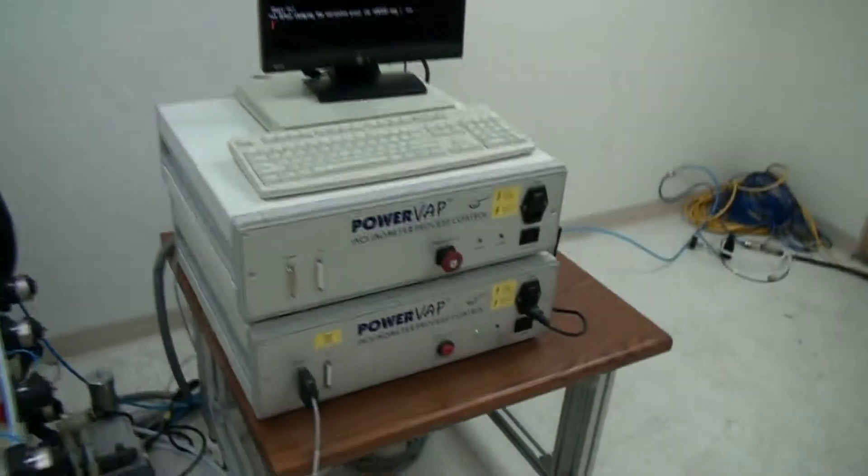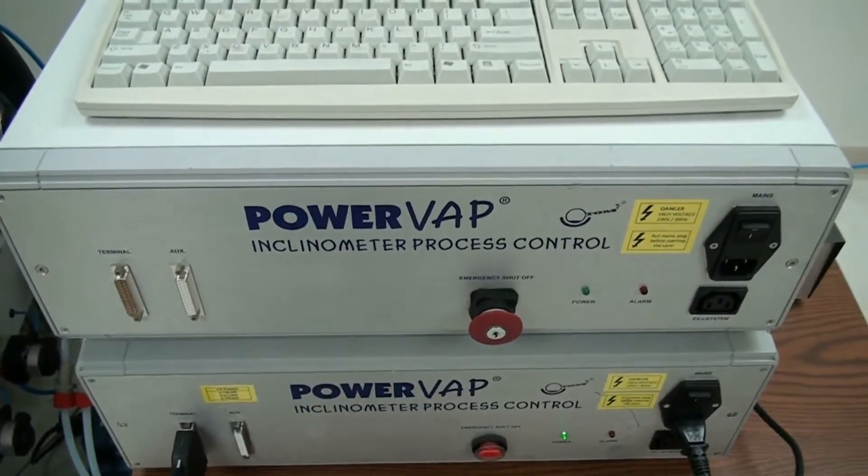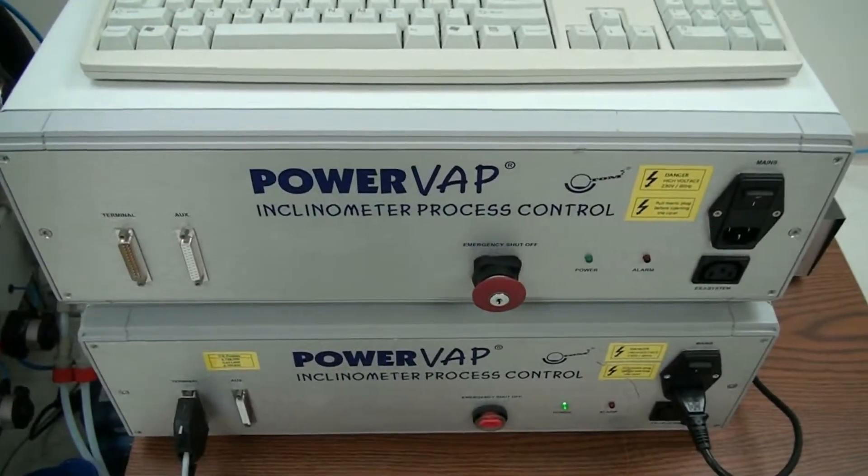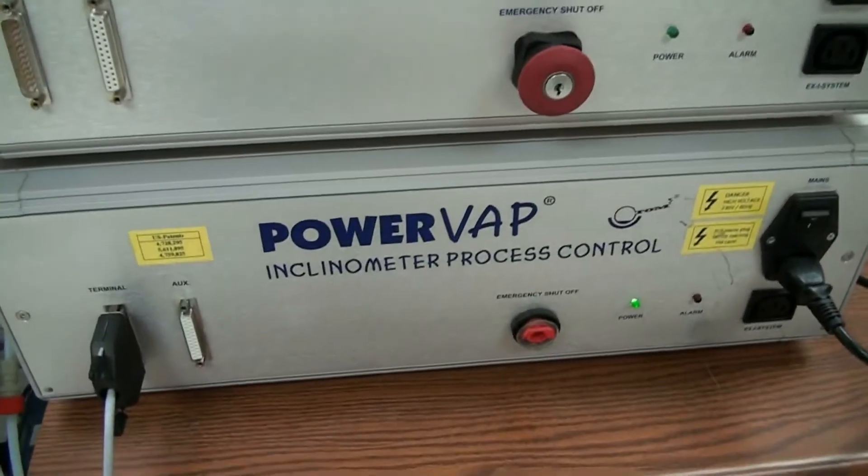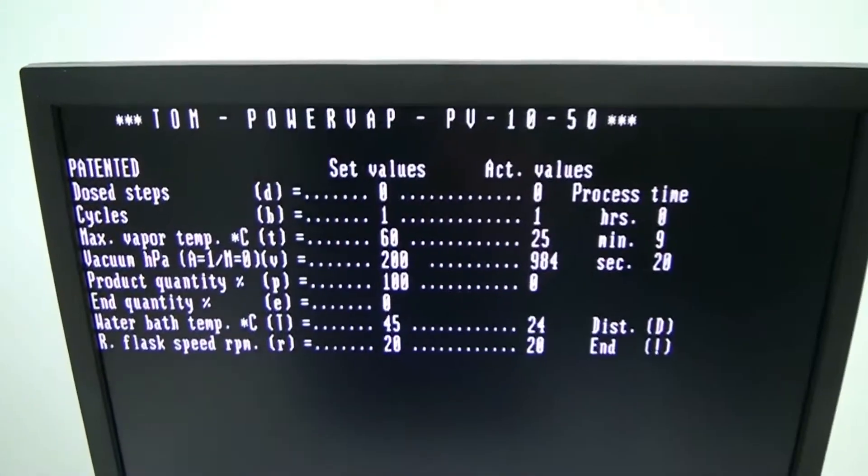Once you set your parameters on the control panel over here, we actually have an extra control panel that we're giving with this just for parts in case you need any parts off of it. The bottom one is the one we're actually running on this system. You can see in the screen here all the parameters that are set right now.